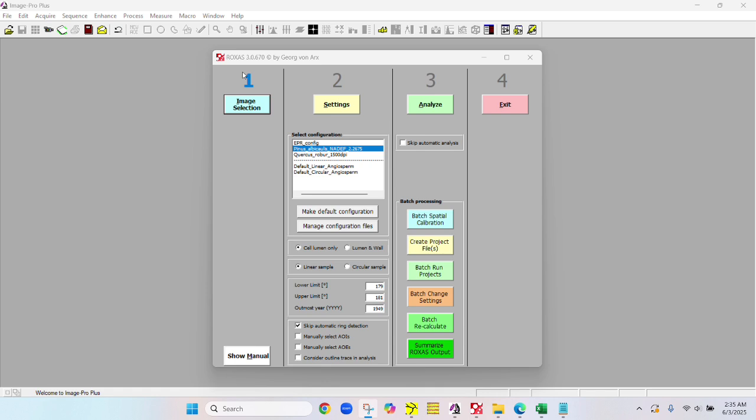And a couple of other videos, just two of them, I actually videoed when I had version 3.0.1. It is a little different, so just be aware of that with the video on curvature and the video on compression wood, which are really short and not focusing on how to do certain things with certain tools. It's mostly just when you encounter anomalies in the wood.